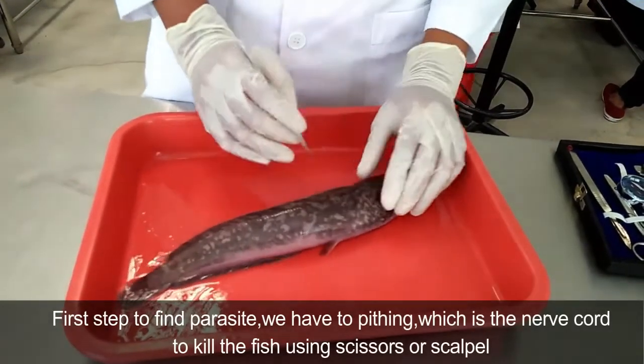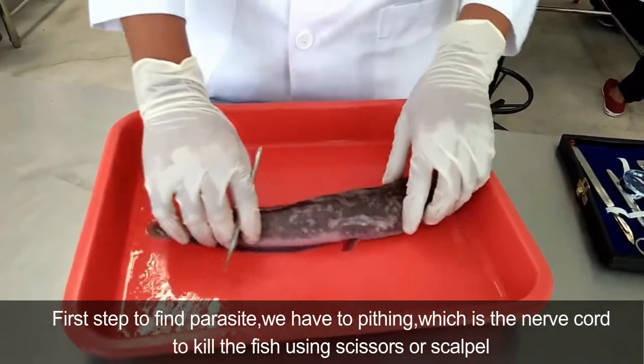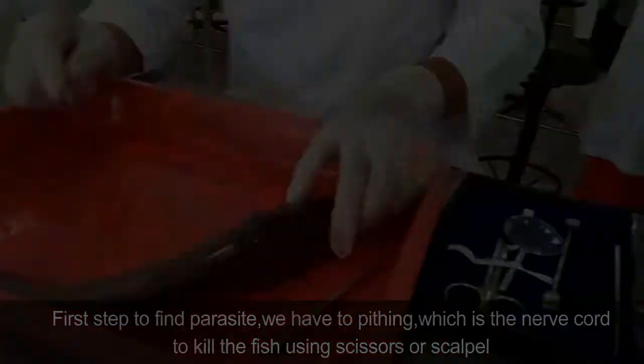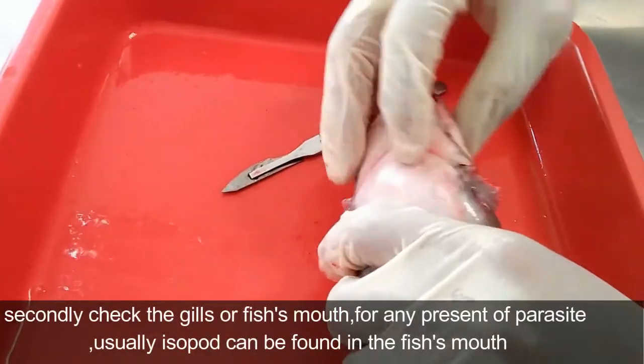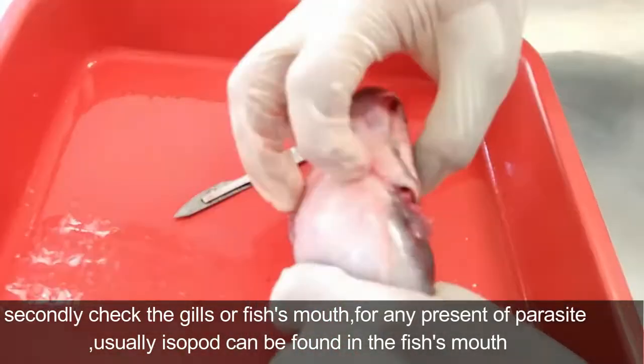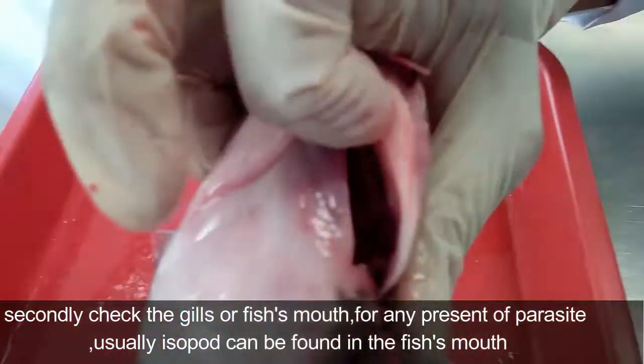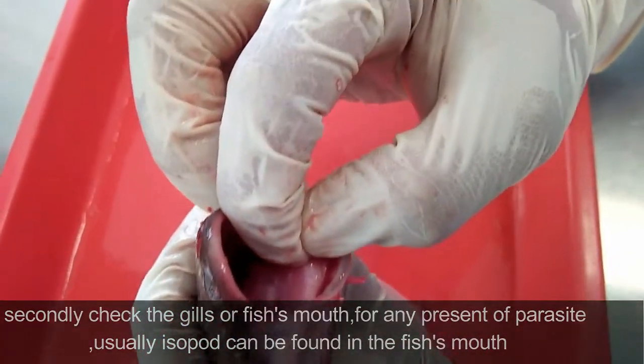The first step to find parasites: we have pithing, which is cutting the nerve cord to kill the fish using scissors or scalpel. Secondly, check the gills or fish mouth for any presence of parasites. Usually isopods can be found in the fish mouth.